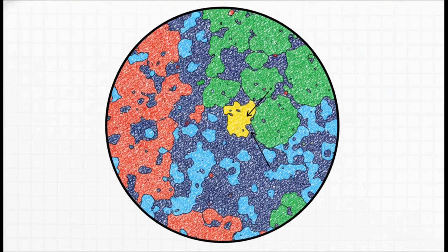The software basically assigns a vibrant color to each detected element. Say, aluminum is shown in red, silicon in green, oxygen in dark blue, zinc in light blue, and gold in yellow. When you view these maps side by side or combine them into a gorgeous final overlay view, it instantly highlights the chemical structure of your microscopic sample. You can literally see a grain of gold sitting right next to a clump of silicon. It takes all that abstract data and turns it into a highly intuitive, incredibly colorful heat map.